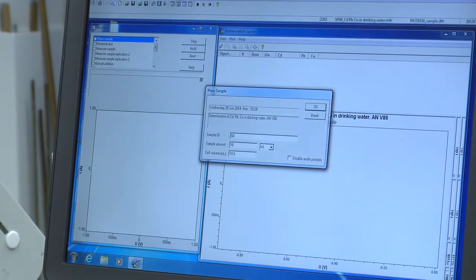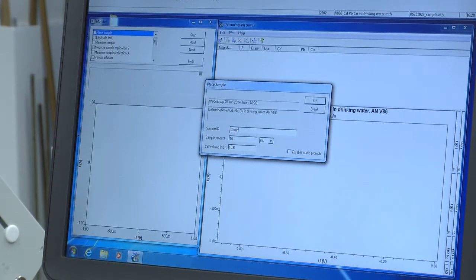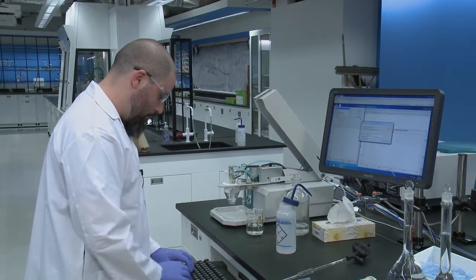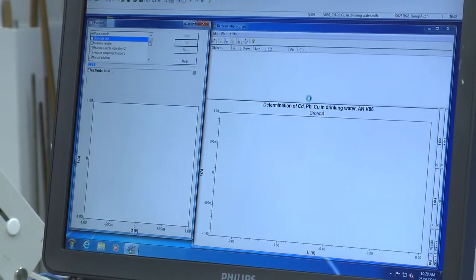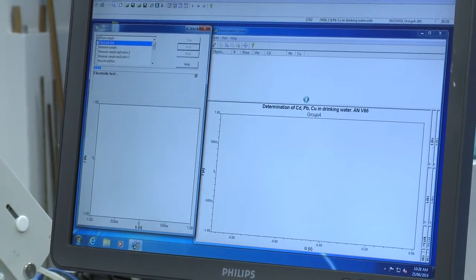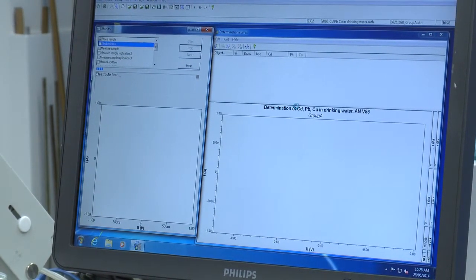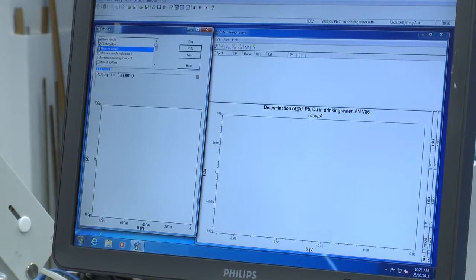Here you'll want to type in something that identifies yourself and your group, and click ok. The instrument will go through a series of tests and then it will prompt you to inject the standard addition.